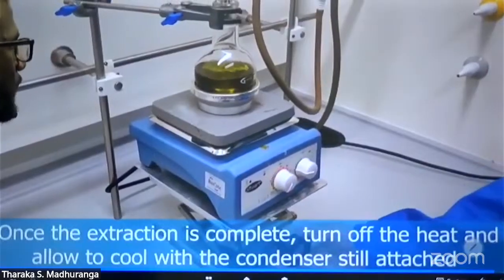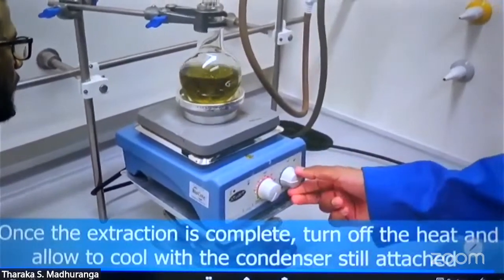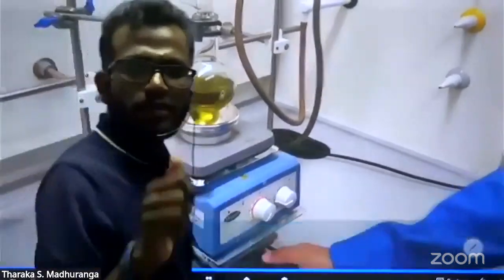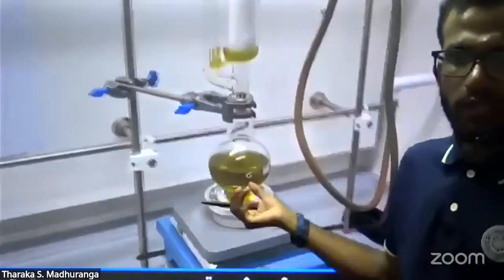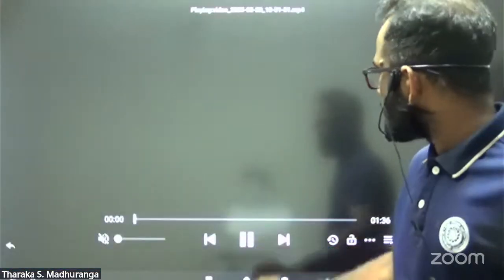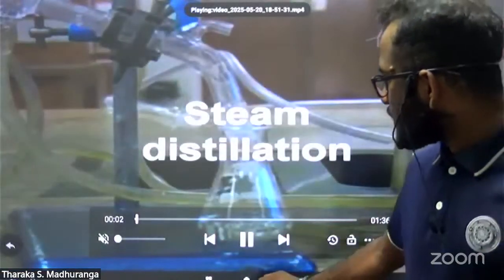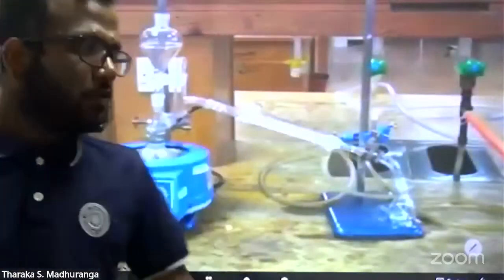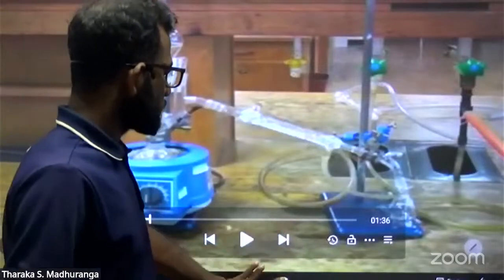Then we can adjust it, and after all cycles are complete, we can remove the heater and we can get the solvent and go to our other processes.